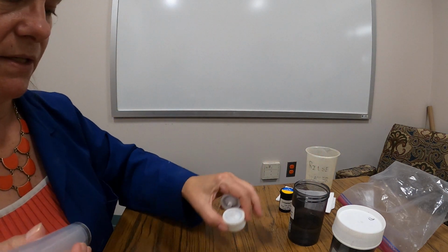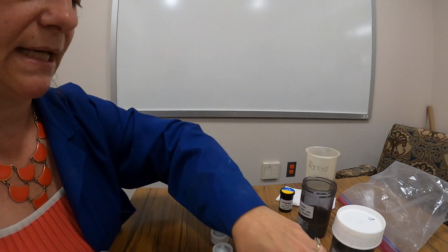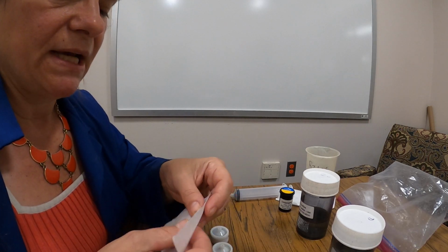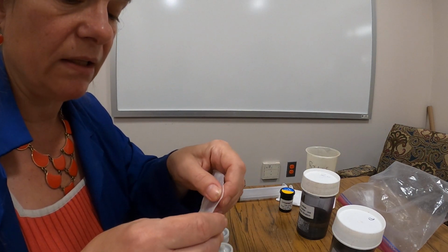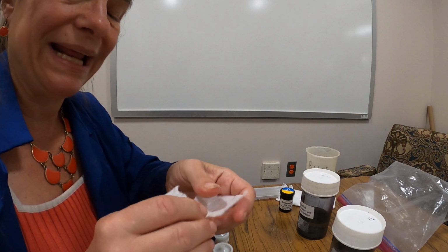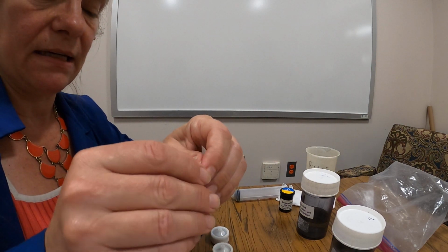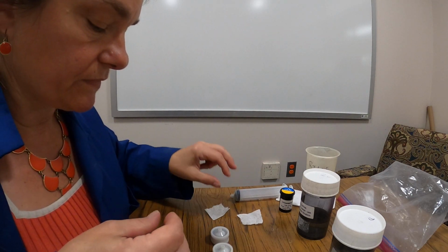So now I have my 2 filters from my first sample. I can put that aside. And what we need you to provide with your chlorophyll kit is some kind of a filter. This is a piece of a coffee filter. These work really well. Or a white paper towel. We don't want any kinds of paper towels with ink on it. We don't know how the ink would behave. So I'm just going to take a square out of my coffee filter.